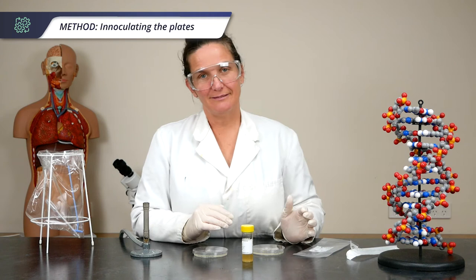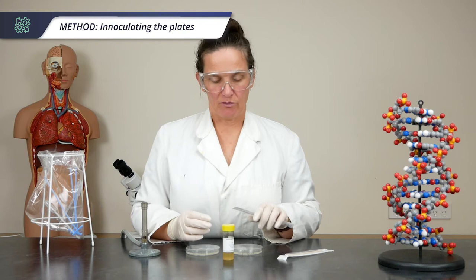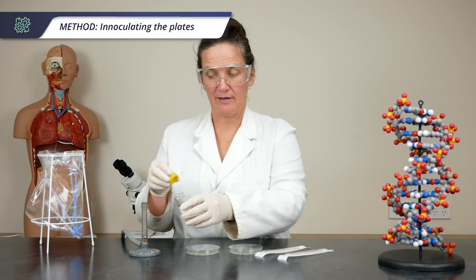Make a lawn on your control plate in exactly the same way. The second technique I'm going to show you is using a sterile swab. It can be a bit more difficult to get a nice even lawn, but you use slightly less bacteria, so that might be preferable for some schools.